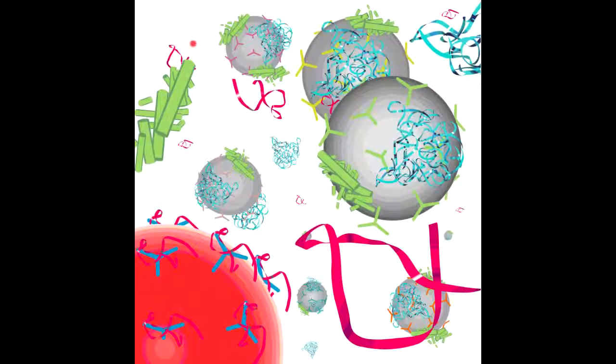But what if there was a vessel on which we could originate our growing peptide chain? And what if this vessel was insoluble to the solvents used in each reaction step? Now we can distinguish our peptide chain from all the other things that we have added into the reaction vessel. This is the fundamental idea of solid-phase peptide synthesis.